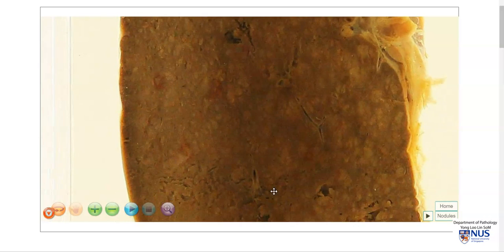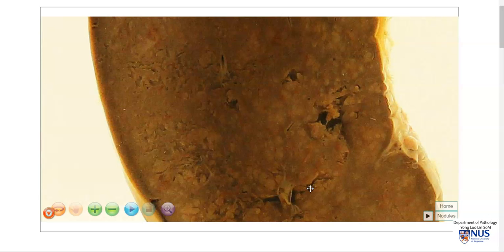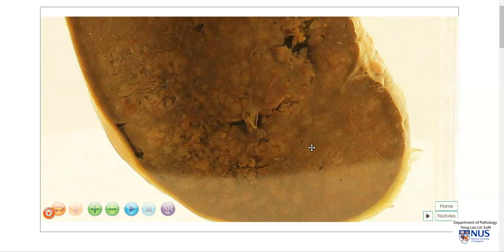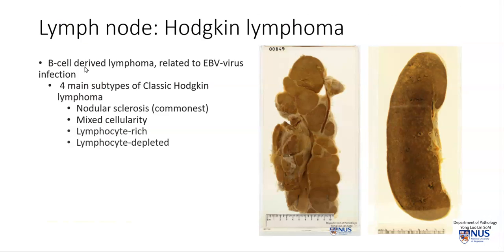I'm just panning through the cut surface of the spleen, where you can see these vague nodular areas. Hodgkin lymphoma is a B-cell-derived lymphoma, and it is related to EBV virus infection. There are four main subtypes of classic Hodgkin lymphoma: nodular sclerosis, which is the commonest type and can sometimes give a more fibrotic appearance to lymph nodes; mixed cellularity; lymphocyte-rich; and lymphocyte-depleted classic Hodgkin lymphoma.